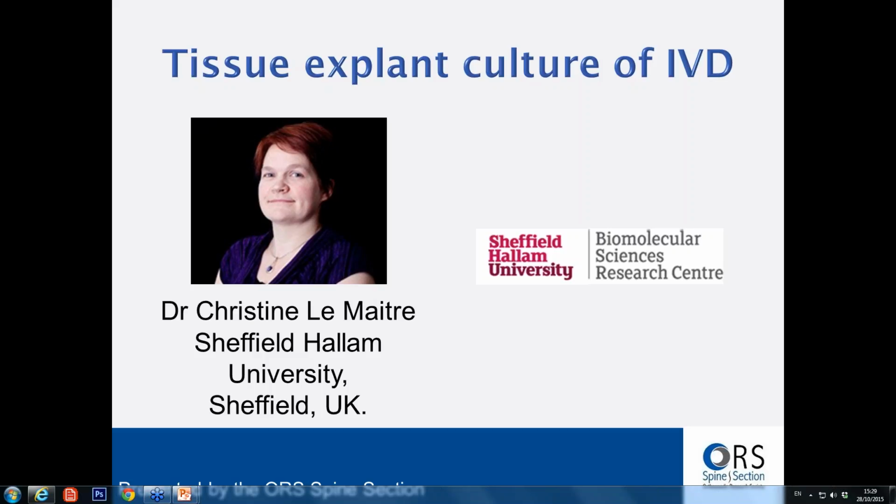So we'll now go on to discuss the use of tissue cultures, which can be done as explants or organ culture systems. So I'm going to start us off with the use of explant culture systems, which is probably the most simple form.